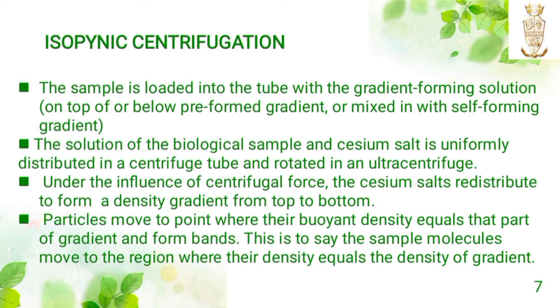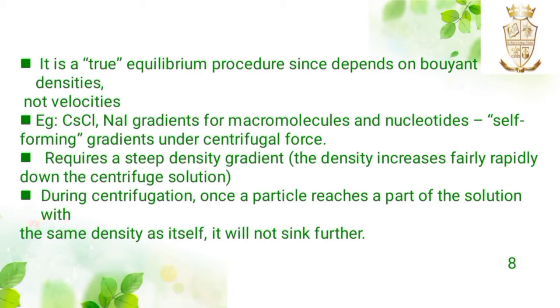Particles move to the point where their buoyant density equals that part of the gradient and form bands. This is to say the sample molecules move to the region where their density equals the density of the gradient. It is a true equilibrium procedure since it depends on buoyant density, not velocity.